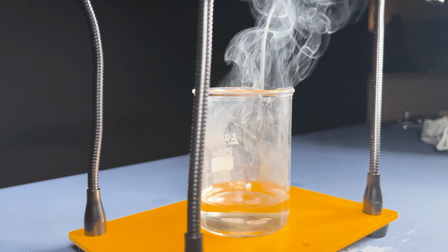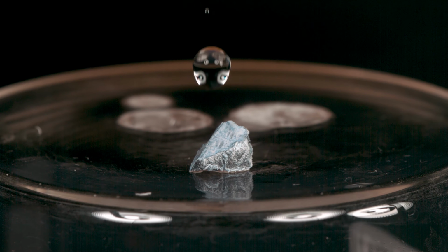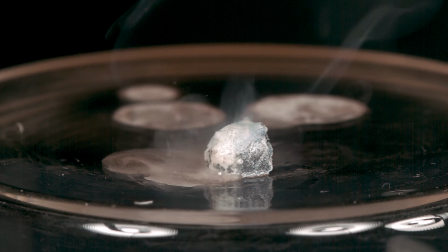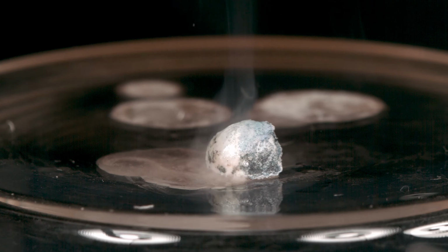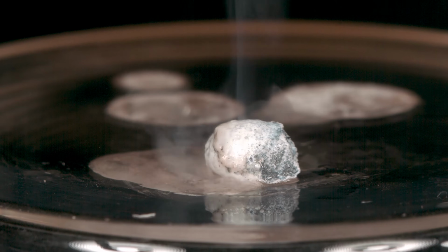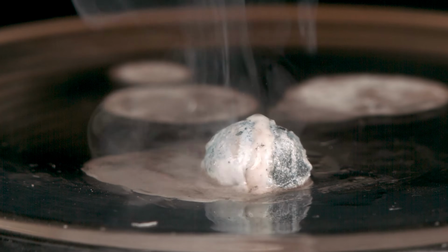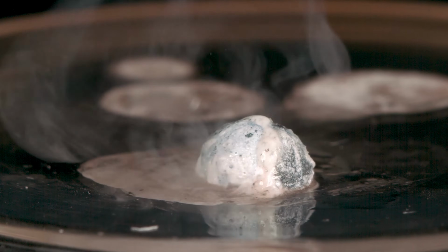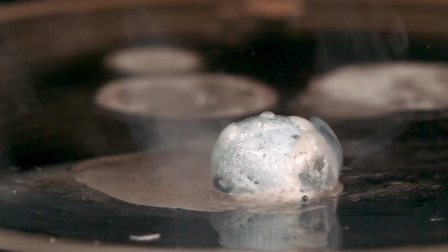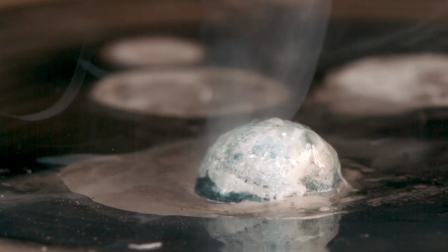This is actually for sodium, and you can see the explosion happens almost instantly. Here's a slow motion shot with a single drop of water. Notice how the potassium reacts almost immediately. In just a second, we'll compare it directly to sodium, and sodium reacts very violently as well, but potassium is even more reactive. The reaction goes from very gentle to instantaneously crazy, for lack of a better word, very, very fast. And in fact, the whole thing begins to melt into a molten ball of potassium pretty quickly because the melting point of potassium is even lower than sodium, so it doesn't take much to melt it.